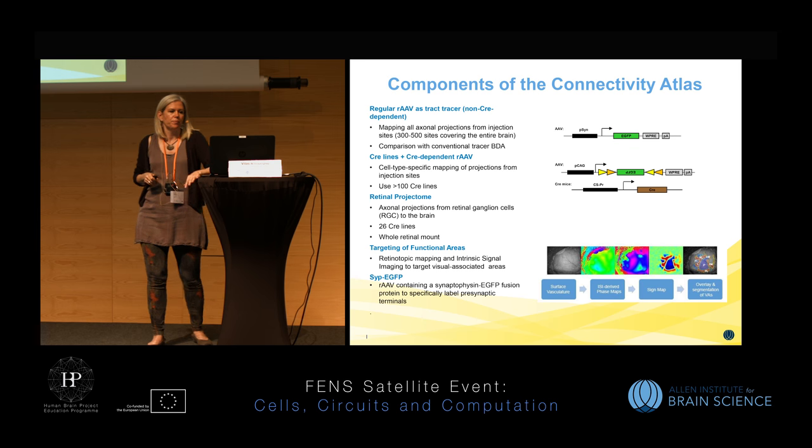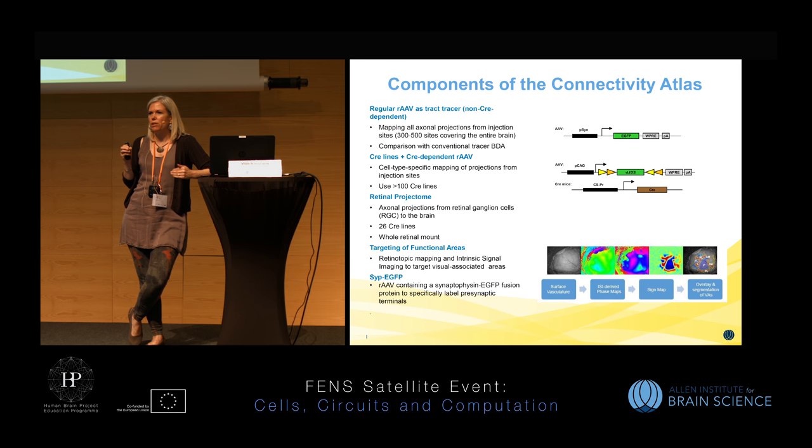And then we know for sure that we've got basic cabling. The experiment that we did was a cytosolic GFP. So while in some cases, and it's very high resolution, you can see structures that sure look like terminal boutons, we didn't actually do that experiment. So we've started to do that experiment, doing synaptophysin EGFP, which is specifically fused to synaptic terminal, so you can actually see the presynaptic terminal from the injection site.